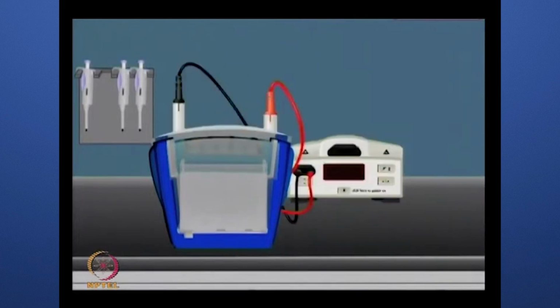and now ensure that assembly is properly sealed and buffers are properly placed, so that proteins can be separated based on their molecular weight. Depending on the gel length, you can perform the second dimension separation for a few hours.